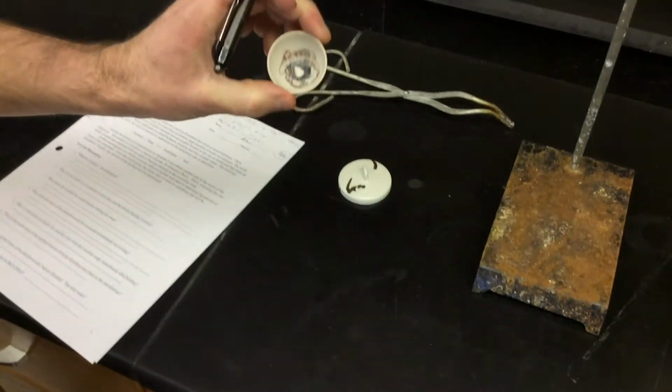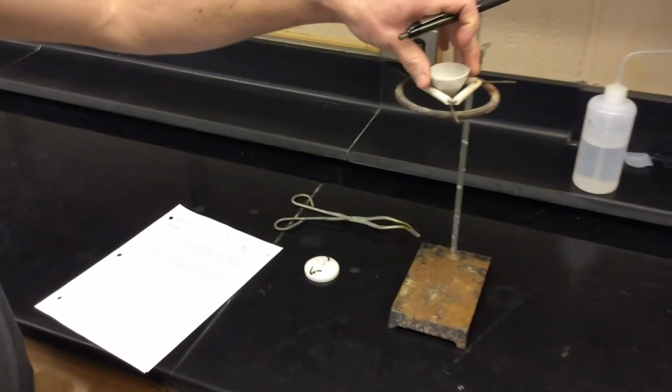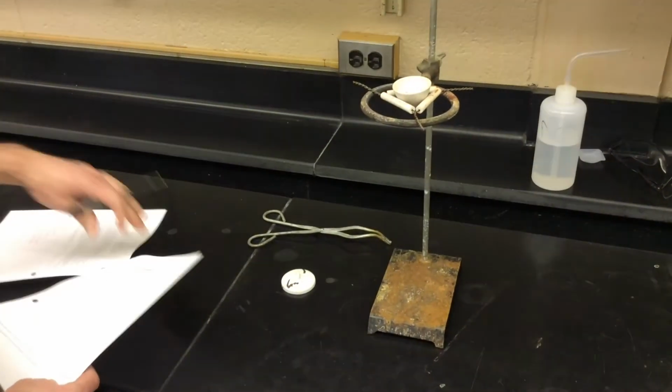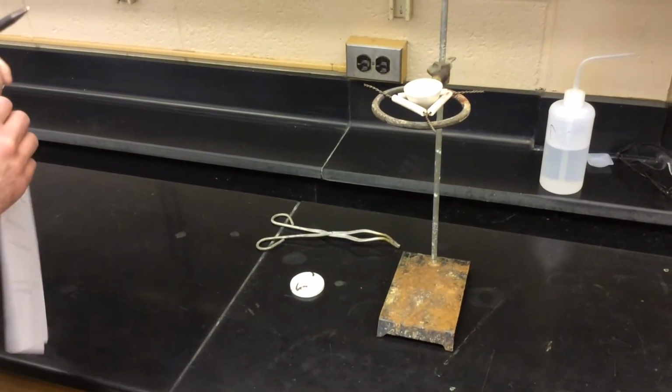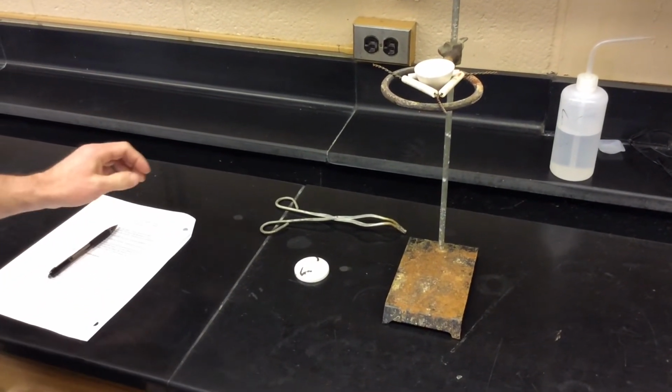Now in the lab, we're going to use the crucible. You're going to put a little bit of barium chloride dihydrate in here. It says, I think, about 2 grams. It doesn't matter the exact amount. Don't try to get it exactly 2, but you should write down the exact amount. You don't have to go for any specific number.